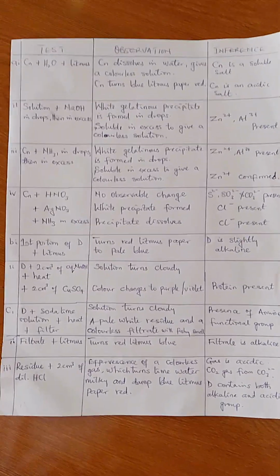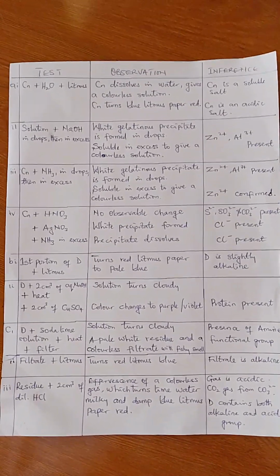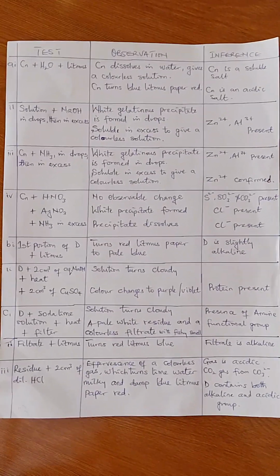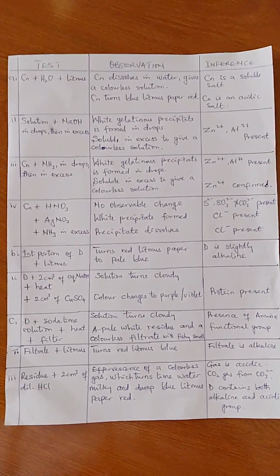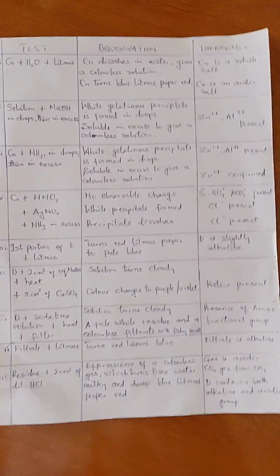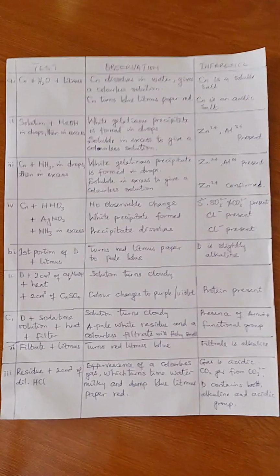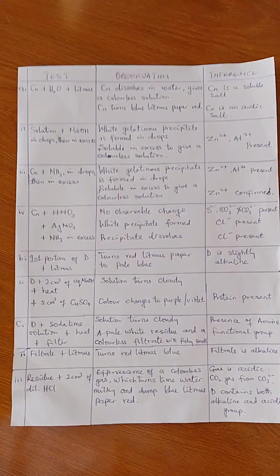This year, the information reaching us is that we have zinc chloride and we also have powdered milk. And we wouldn't know if they will mix them together or if they will be separate. But from what I think, they will be separate, because to mix them together will be a very terrible analysis. So I try to put them in a way that we test, because with zinc chloride you can test for the zinc ion and the chloride ion.